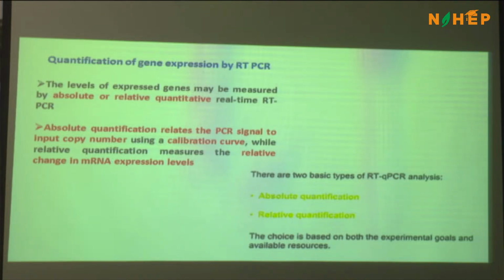Okay. What was the gene you used yesterday? It's actin. Actin. Okay. So there are plenty of choices, but those who are doing this kind of analysis, you have to standardize the amplification of the so-called reference gene beforehand, okay, and gain confidence in the reference gene. There should not be any significant changes in their expression under the experimental conditions. Ensure that, okay.